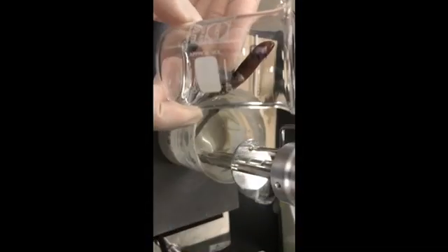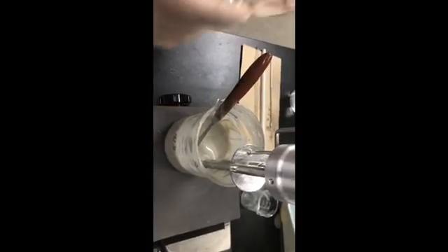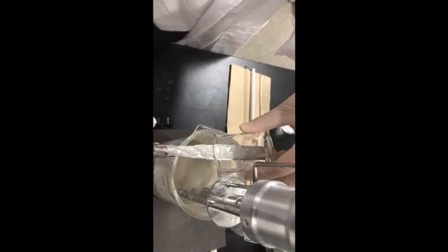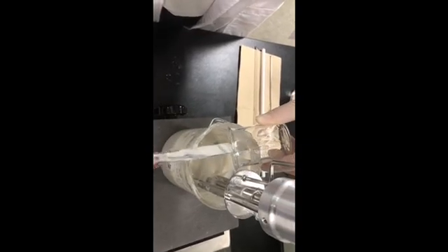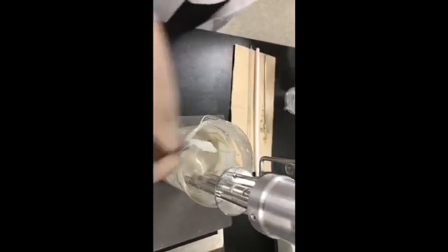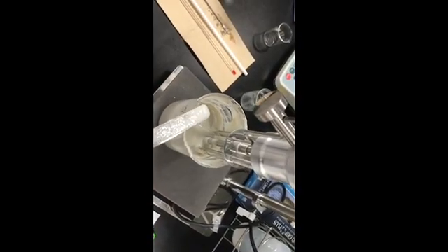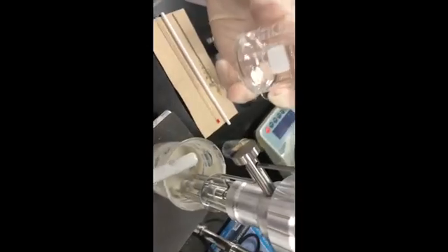Then adding E and F, mixing at around 2,000 rpm for 1 to 2 minutes. Now we are adding E, and now we are adding F.